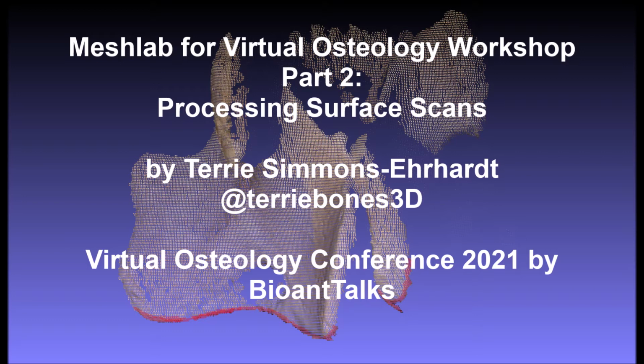The second video covers a basic workflow for processing 3D surface scans in Meshlab, including editing, aligning, merging, and making a watertight mesh. There are many variations on this workflow depending on what you're scanning, how many scans you have, and whether you want to work with textures or vertex colors. But this video presents the most basic tools and workflow to get you started.